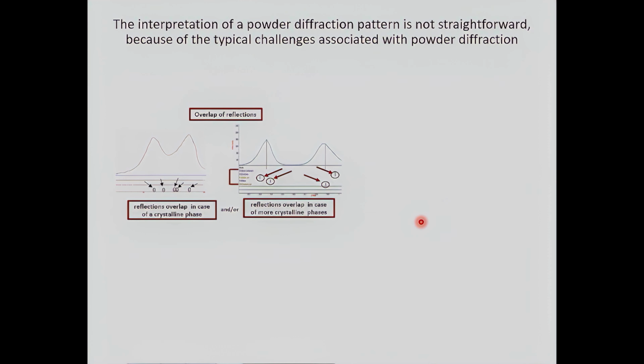And then, what are the problems that make it difficult to characterize or study diffraction data? First of all, as I said, the overlapping. You can see it better here. Here I have a part of your diffraction pattern, and we see we have collected only 2 peaks.